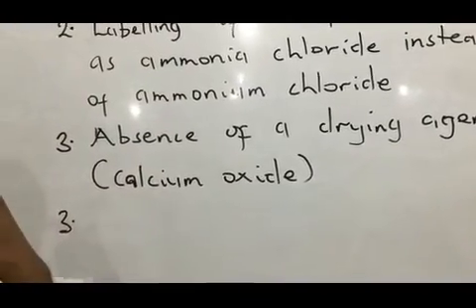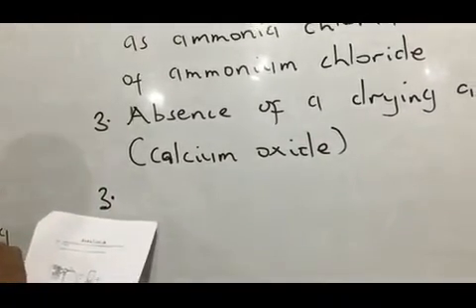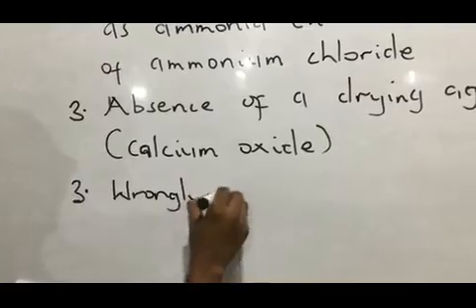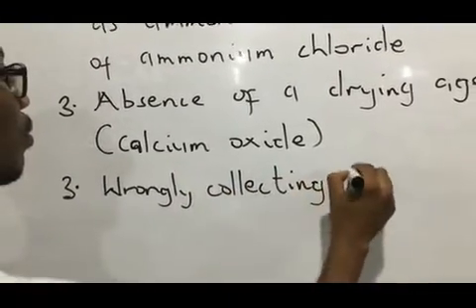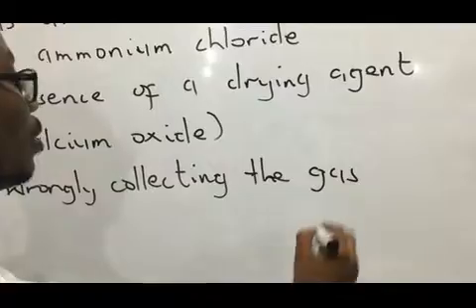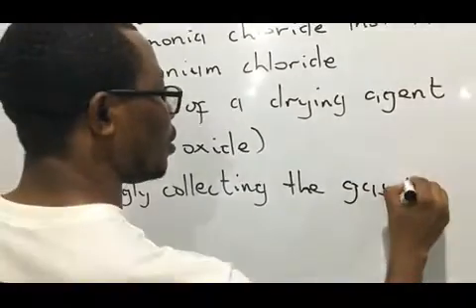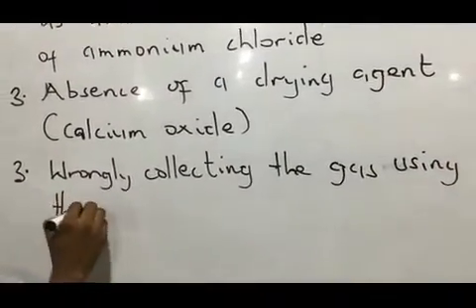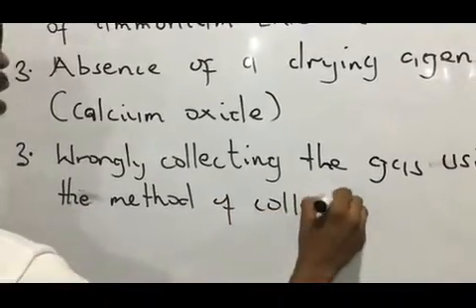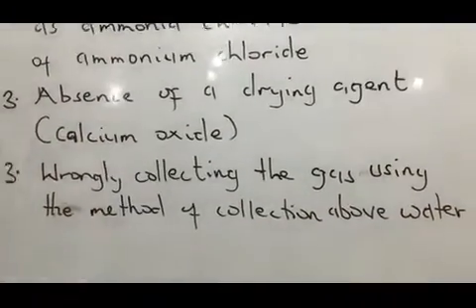And then wrongly collecting the gas using the method of collection above water. So that should be number 4.